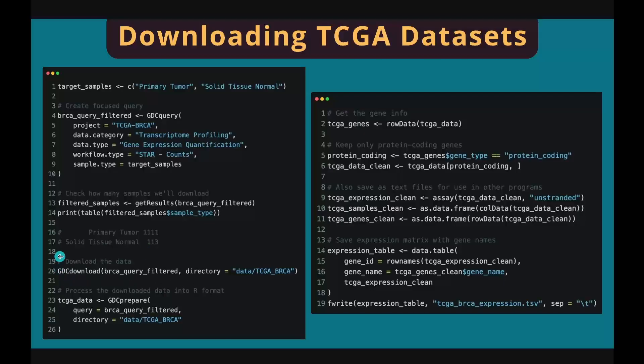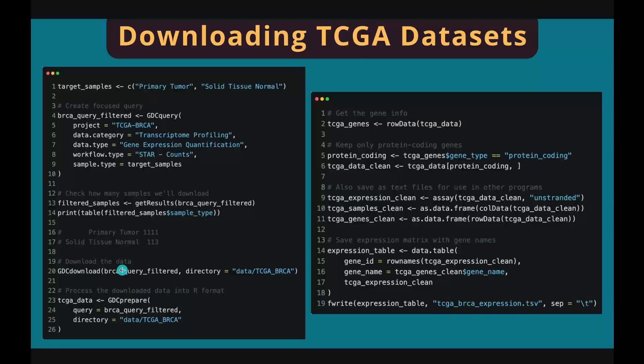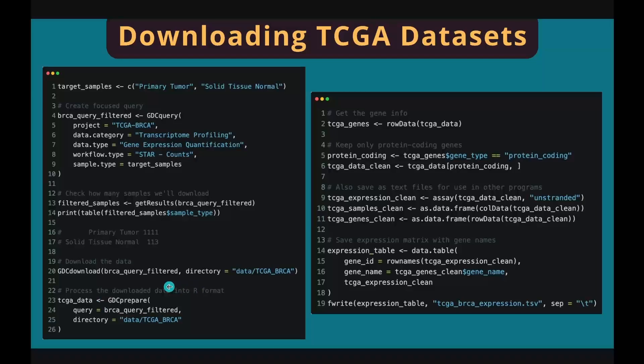The GDCdownload function downloads the actual data to your specified directory on your laptop. However, the downloaded files are not directly usable. You have to read them back to R using GDCprepare function once the downloading is completed. The output of GDCprepare function is a special R object which contains gene information, sample information, and gene expression matrix.